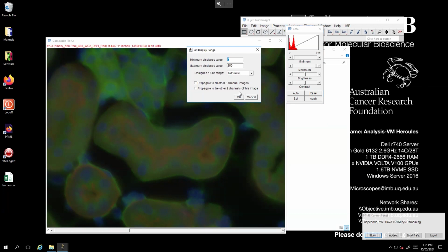So have a go at making this picture look better. And hopefully everyone's will look the same.